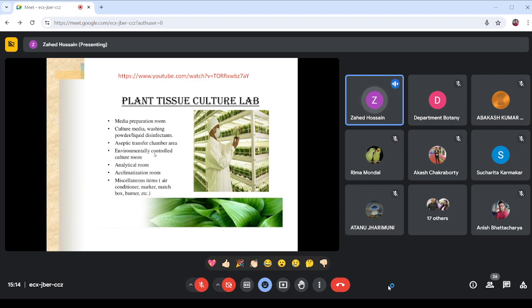It may be the temperature. The temperature is being maintained by using air conditioners. Usually two air conditioners are installed in alternation, in a series, so that using a timer, one may operate for four hours, and the next one may operate for four hours, like that. So it maintains the temperature of that culture room at 25 degrees centigrade, plus or minus one.